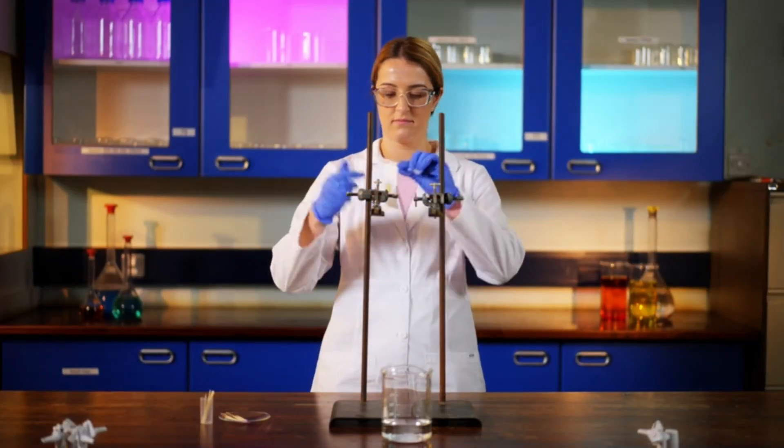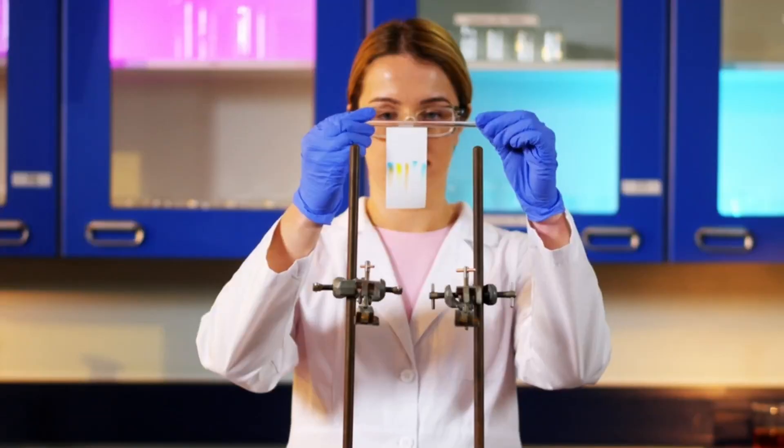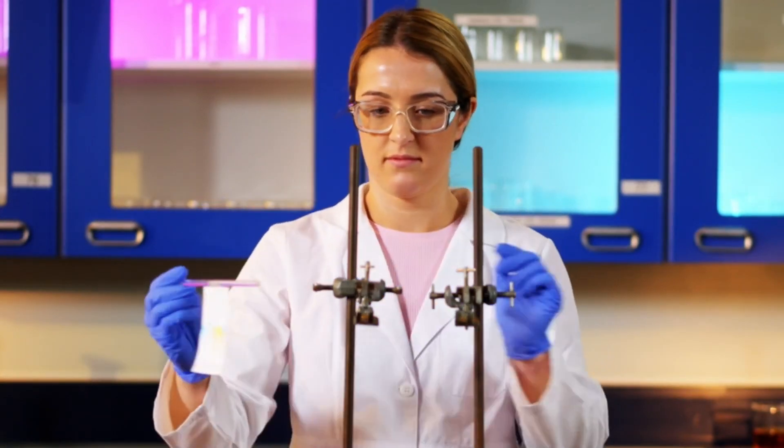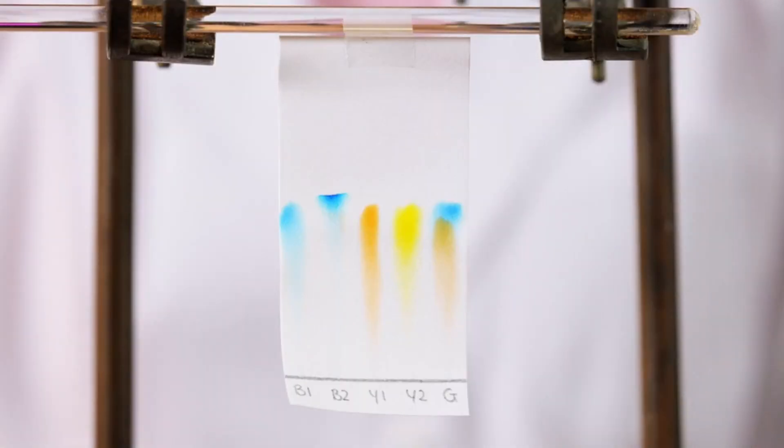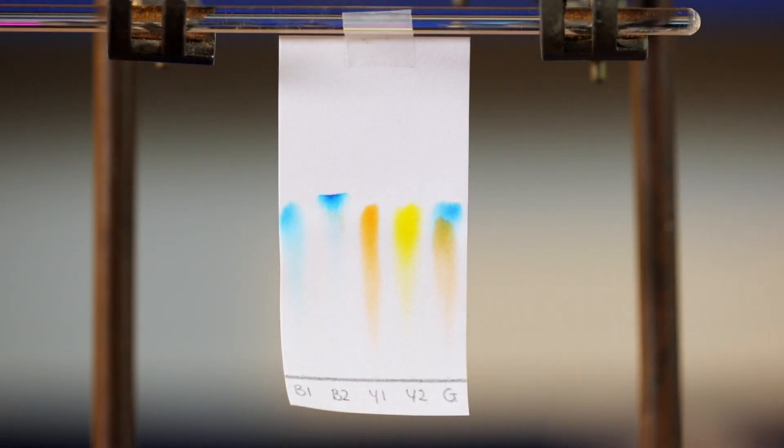This happens because some pigments are more soluble than others. The more soluble the pigment is, the longer it stays dissolved in the water and the further it travels up the paper. The yellow and blue food colorings each contain one pigment. They are pure substances.